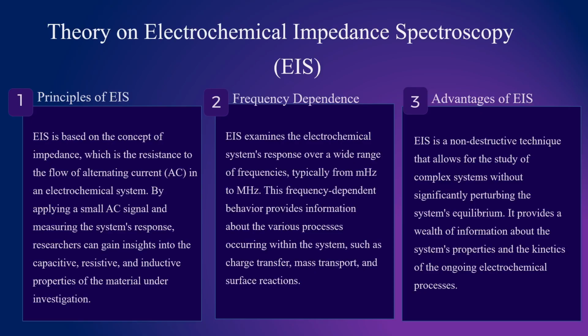So what are the main advantages of this spectroscopy? It is a non-destructive technique that allows for the study of complex systems without significantly disturbing the system equilibrium. And it provides a wealth of information about the system properties and kinetics of the ongoing electrochemical process.